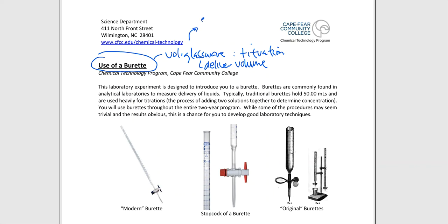And the pipettes had an etch mark, right? So this etched mark is the line that we need to pull our volume up to. So the bottom of that meniscus is sitting on the etched line of that glassware. As long as we do that, we deliver one volume, meaning that if this was 5 milliliters, that volumetric pipette is meant to deliver 5 milliliters. And it does that with very high accuracy, and you should be able to do that with very high precision.